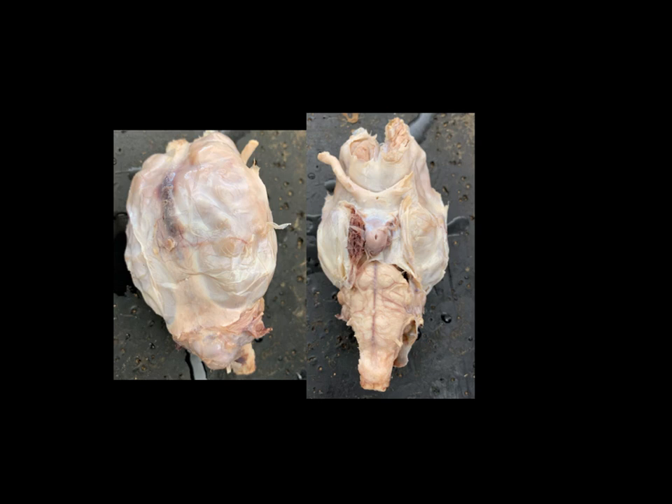Hi, everyone. This is going to be a walkthrough of the sheep brain for Bio 137, and this is one of the tougher things we learned this semester because where this is an actual specimen as opposed to a model, everything is kind of the same color and blends together, and there's only going to be a few features that really stand out. So when we get to some of the dissected images coming up, pay very close attention to what I'm pointing at with the laser pointer so you know exactly what structures I'm pointing to.